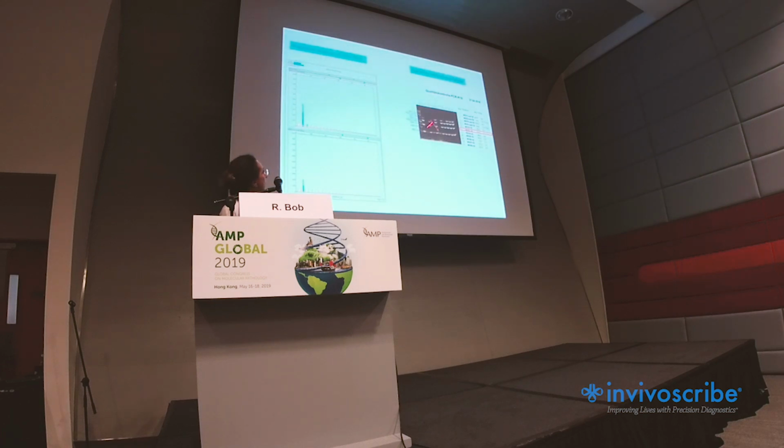That's the fragment analysis. We applied it only for framework 3. You see we have a reproducible peak. So we interpreted the result of all of these analyses as the presence of a dominant clonal B cell. But if you want to see what's the reason, this is the specimen control size ladder. You see this is sample number 6. The amount of DNA is quite good, and the size of the specimen was also large enough. But the quality of DNA is very suboptimal.